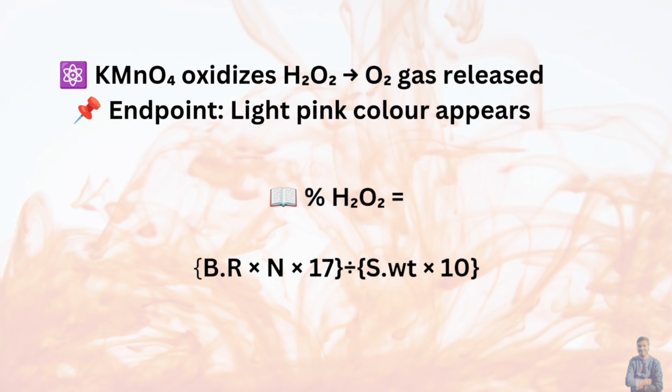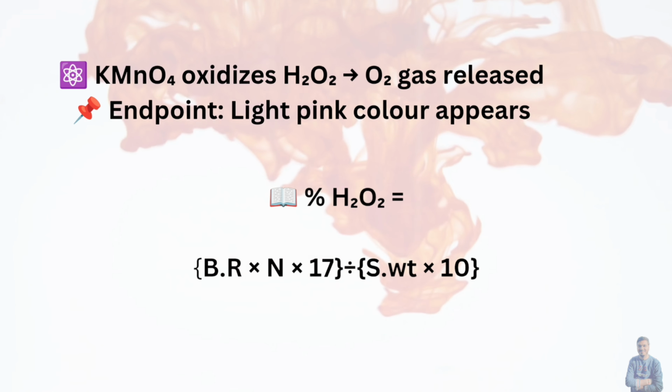Let's watch the reaction in action and see chemistry come alive.